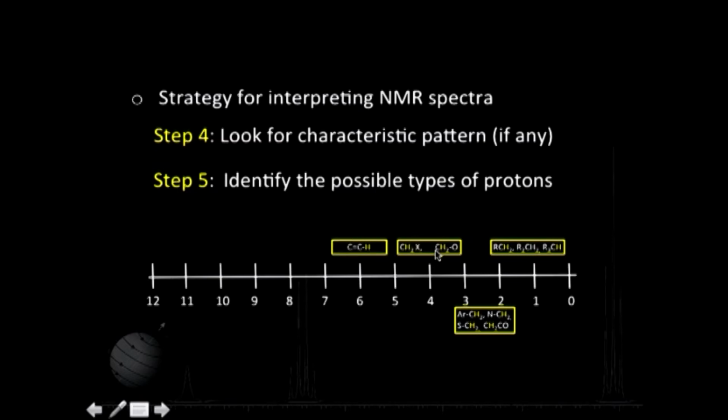And then going further, this is the typical region, about 5.5 to 6.5 or so, where we look for the unsaturated protons. And then 7 to 8 we all know very well, it is the range for aromatic protons. Then around 9 to 10 we look for the aldehydic protons, and from 10 onwards, 10 to 12 or so, we look for acidic protons. Carboxylic acids are observed somewhere in this range.